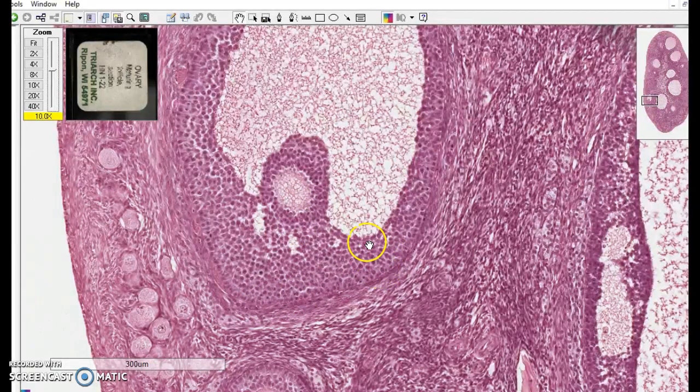So basement membrane, stacks of cells, you'll see it again in the context of an ovary, a mature follicle or graphene follicle in an ovary. Stratified cuboidal epithelium.